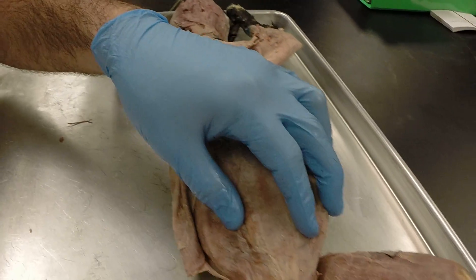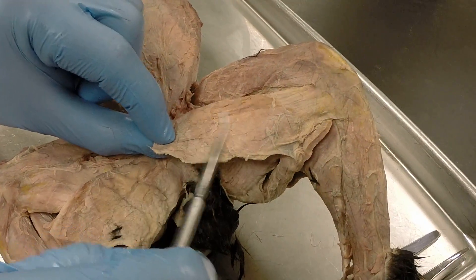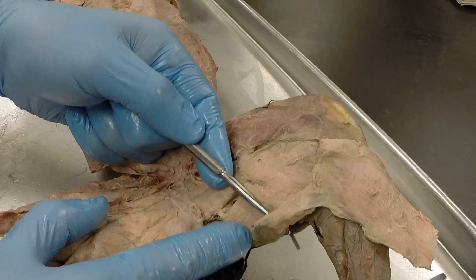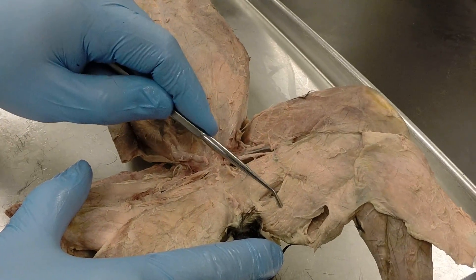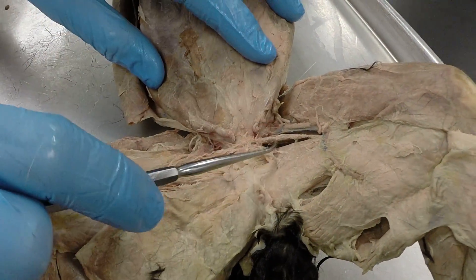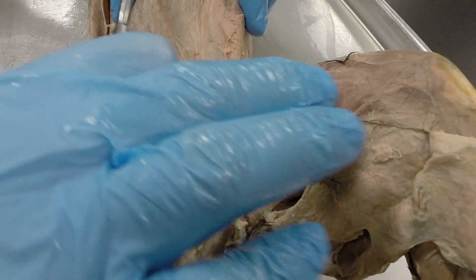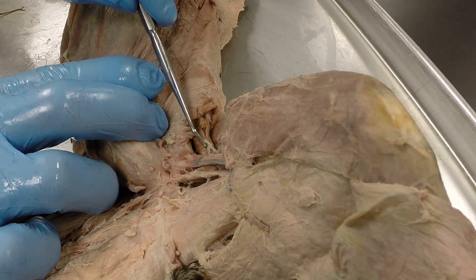Moving down to the legs, starting with the medial side, we have a large thin superficial muscle — the gracilis. Peeling that back, the most posterior muscle is the semitendinosus, which is thin like a tendon. Then we have the semimembranosus, which is thick and wide like a membrane. Then the adductor femoris, the adductor longus, and the small pectineus muscle. Opening up between the abdomen and the leg, you can see the iliopsoas muscle running with the axis of the body.